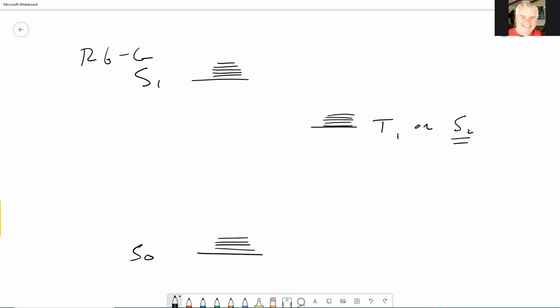But basically, you can imagine going through the ultraviolet spectrum. Let's change colors here, and let's do an ultraviolet spectrum in theory. So we start with long wavelength light, right? What's going to happen here is that we'll start with an excitation arrow that maybe is, say, this long.